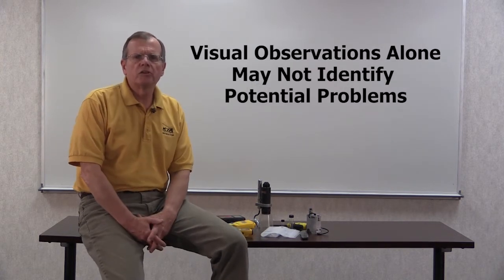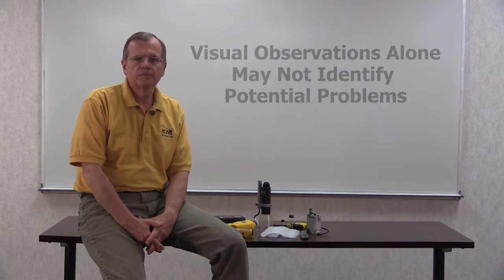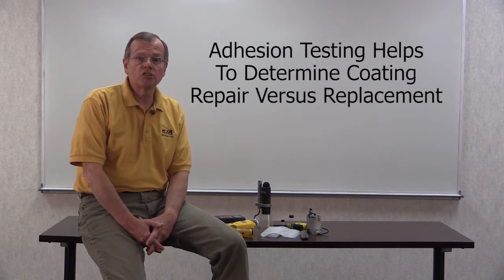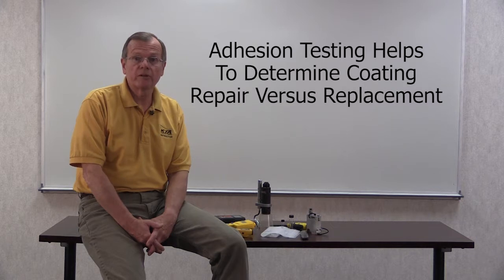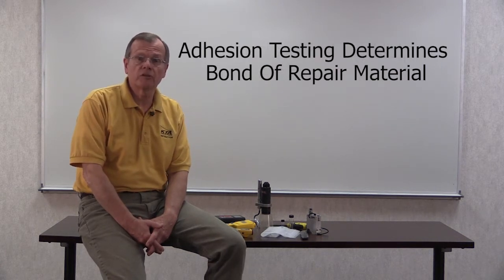Visual observations alone are often not adequate to determine the extent of potential problems. A coating can appear to be sound and intact, but possess a level of adhesion that will not withstand the abuse and wear that can be expected. Adhesion tests are used by professionals when rendering an opinion as to whether a coating should be repaired or replaced. If a coating is repaired, adhesion tests are also used to confirm that the repair material exhibits adequate bond to the existing coating.